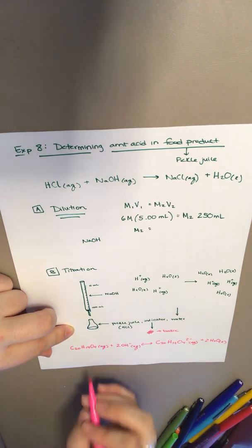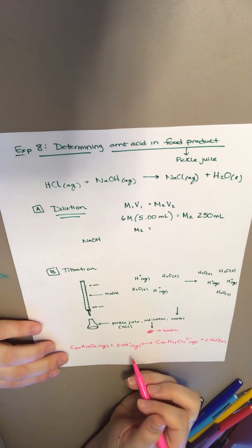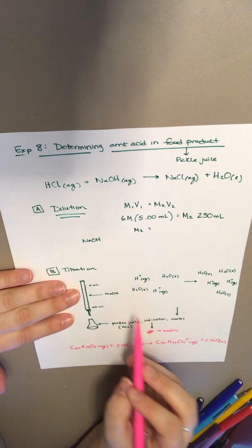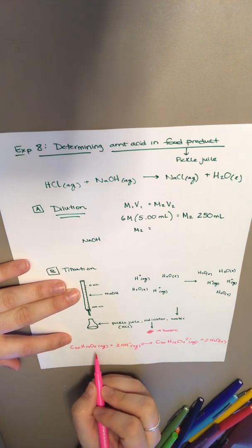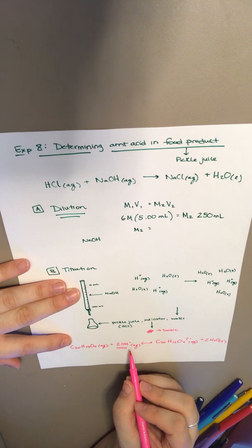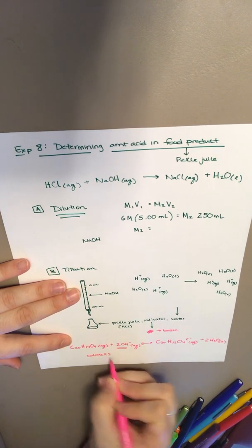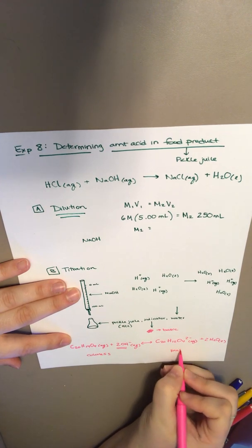So in addition to the acid-base reaction, when there is more base in this solution, it's going to convert from colorless to that slight pink color.